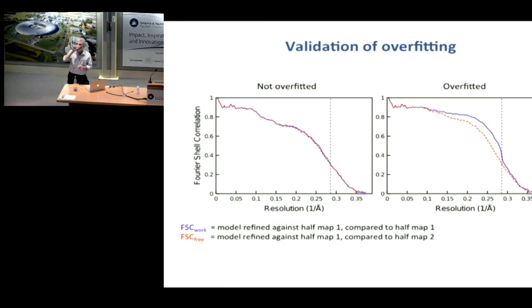Thanks. So I just had a question about the symmetry restraints that you said you could implement. Given my last talk, I've got molecules that are not symmetrically arranged, but I would know the transformation matrices between them. Is there a way to input that information as well? Yes, now you can put transformation matrices.